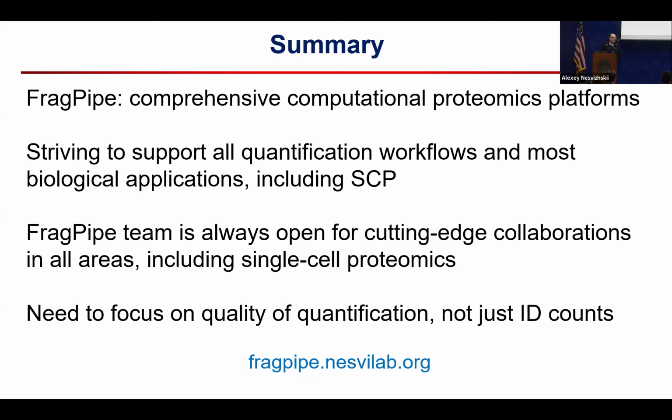So I think it is very important for us, as a community, to discuss what are these metrics that we are happy with, so that we can replace some of the low bar metrics such as consistency of detection or repeatability as quantified by CVs. I agree with you that that's not a very good standard for anything. We can be consistently misidentifying the same signal, consistently misquantifying it, and getting exceedingly low CVs. It's just not a good metric.